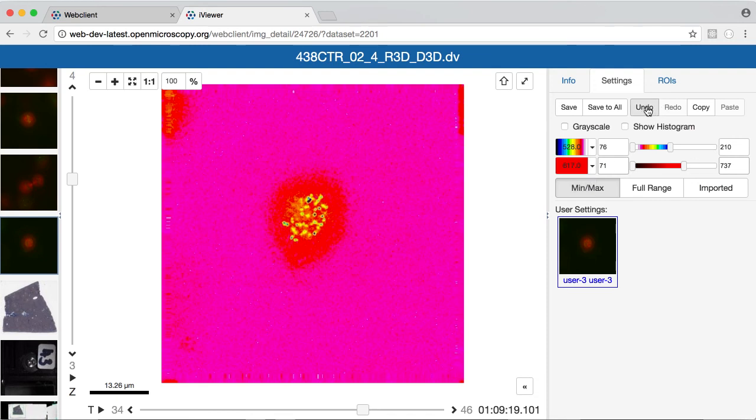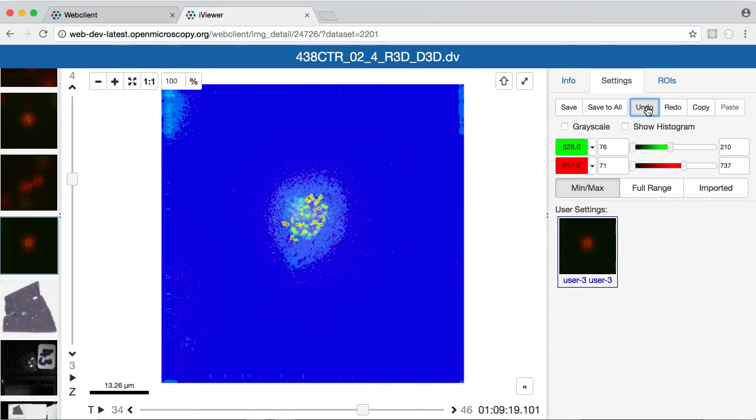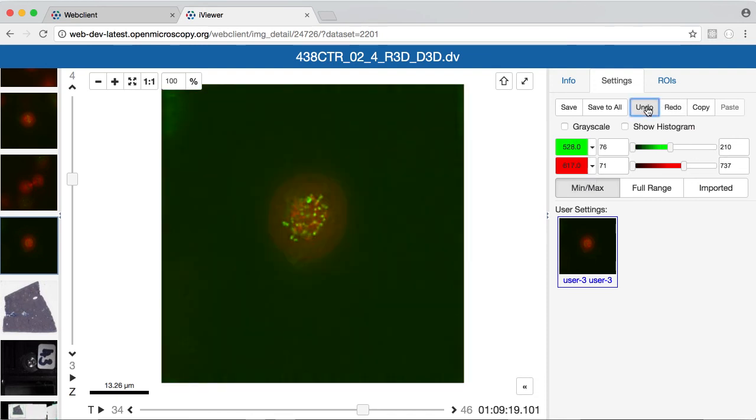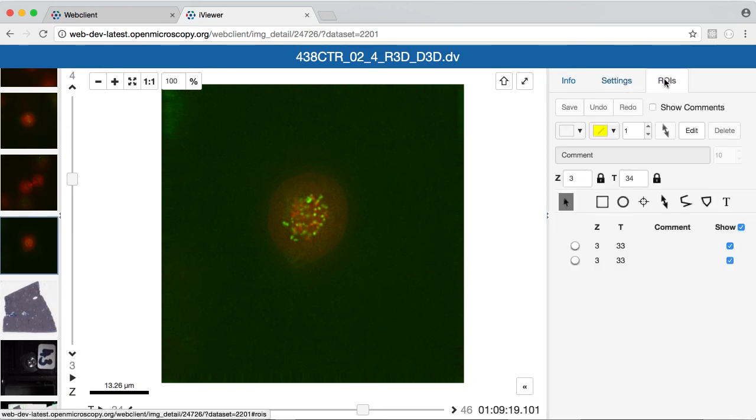Also, I can use the undo features. If I go to the ROIs tab, I can use these tools to create and edit ROIs on the image.